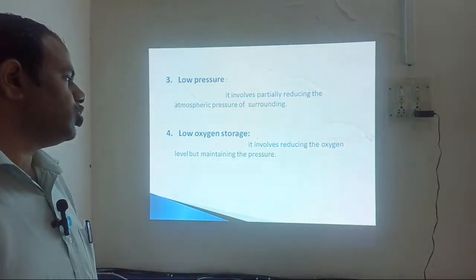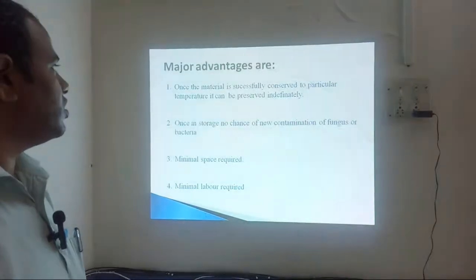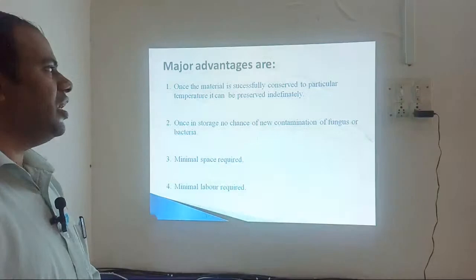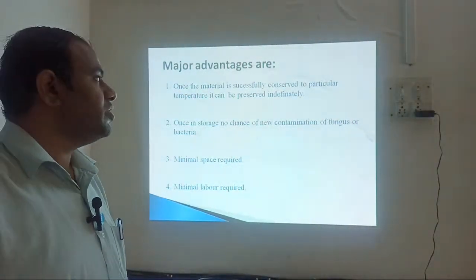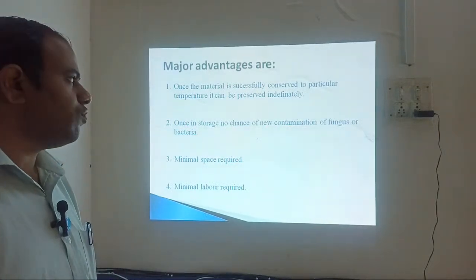So sometimes we also go for low oxygen storage. But we are here concerned with the cryopreservation only. What are the different advantages here? Once the material is successfully conserved to a particular temperature, it can be preserved indefinitely. You can go for around 10 to 15 years of storage also.